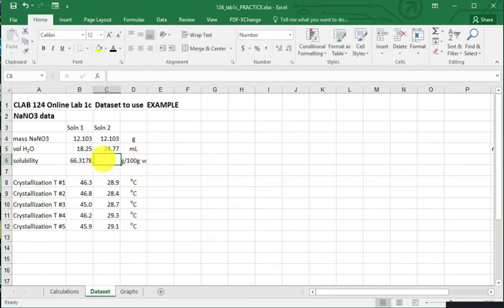And this solution is going to be the same thing. I can either retype it in, or I can just pull over. It turns out if I pull over, right, if I use my Excel tricks and I copy this over, it's going to figure out C4 divided by C5, so it just re-references it over. Or I could have retyped it in. Okay, so 66.3 and 48.9.